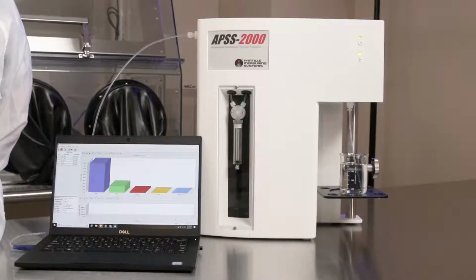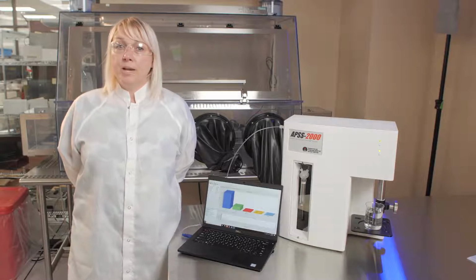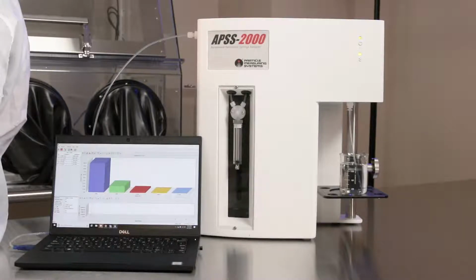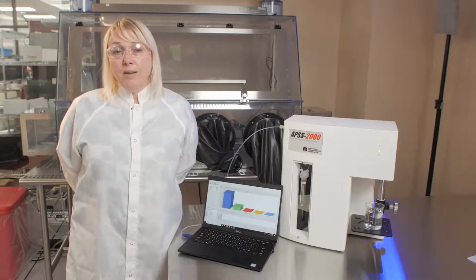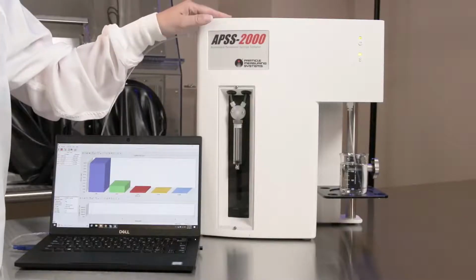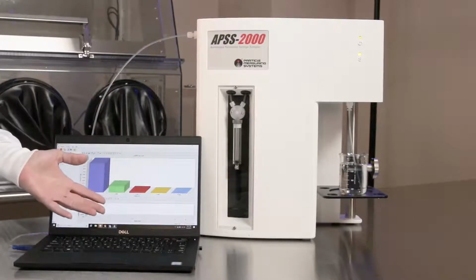The other method is light obscuration. Light obscuration is not manual, it's fully automated. It's the best solution for subvisible particles. 100% of your fluid flow is analyzed and your results are repeatable, which means that you don't have to spend all day long counting and then having a backup counter. There's a syringe sampler inside and the software is on an external laptop.